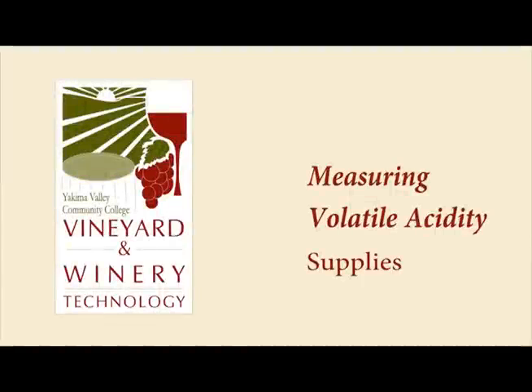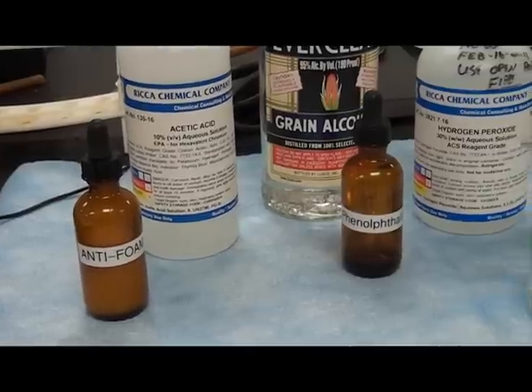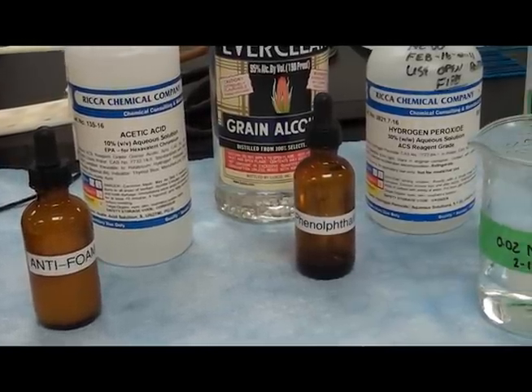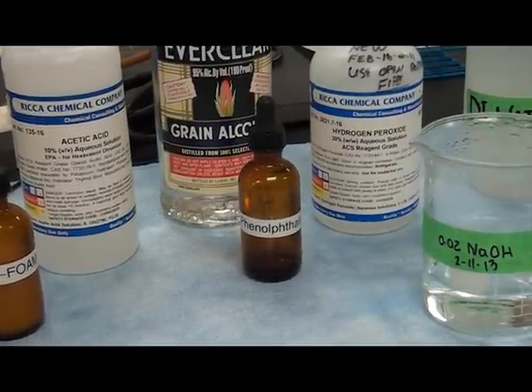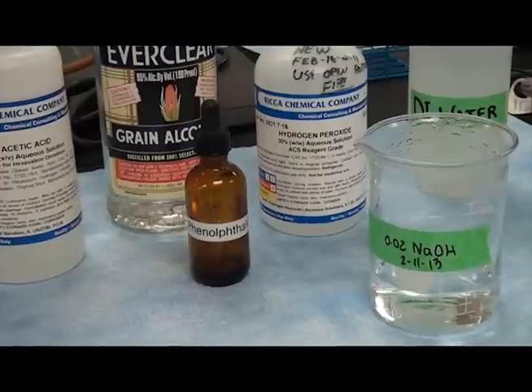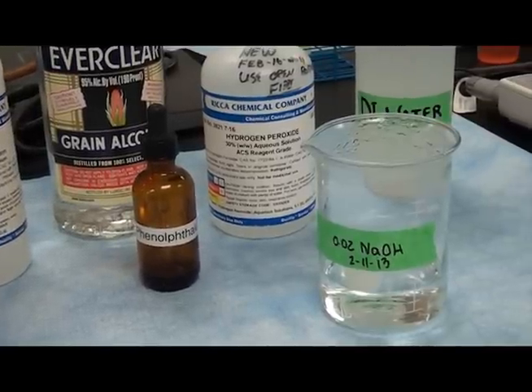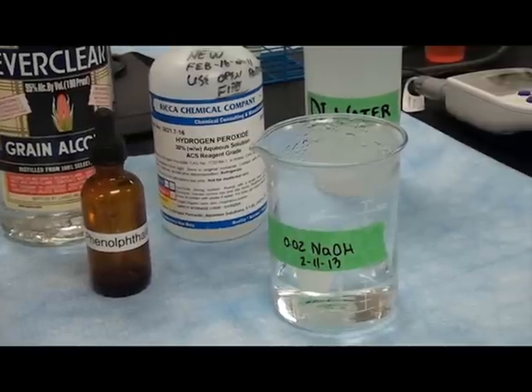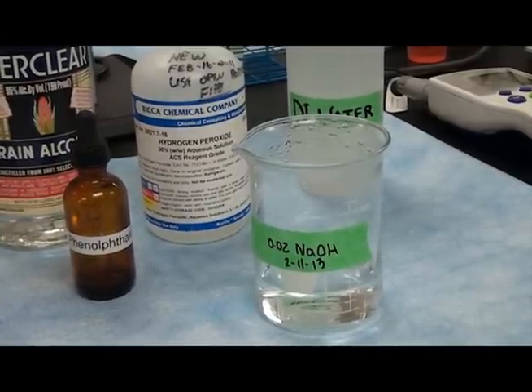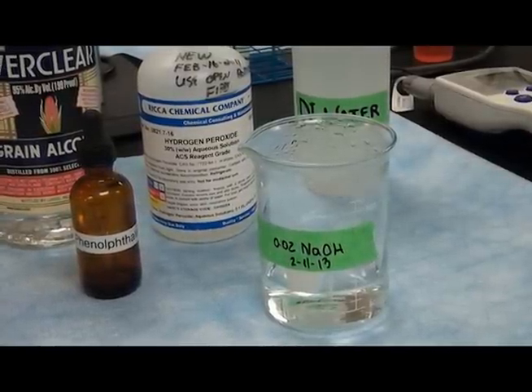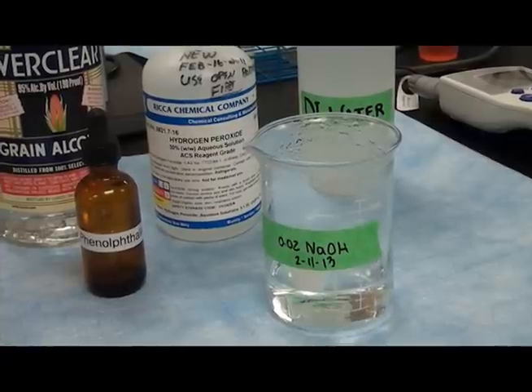Supplies: antifoam, acetic acid, alcohol, 1% phenolphthalein, 30% hydrogen peroxide, a 0.02 normalized sodium hydroxide solution, a DI water bottle, and ice.